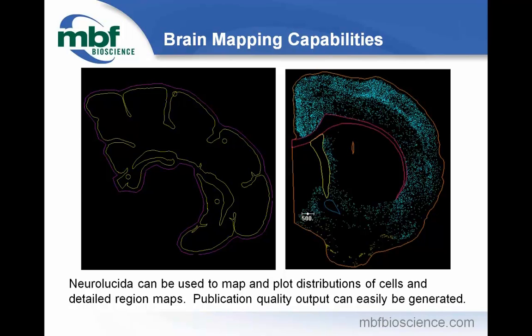In these cases, physical sections on a glass slide that are at a regular spacing through your region of interest are stained for the population that you're interested in following. Then the slides are either imaged or placed on the microscope and analyzed using Neurolucida. In Neurolucida, you will delineate the anatomical regions at your desired level of accuracy and use markers to plot the location of each individual cell.